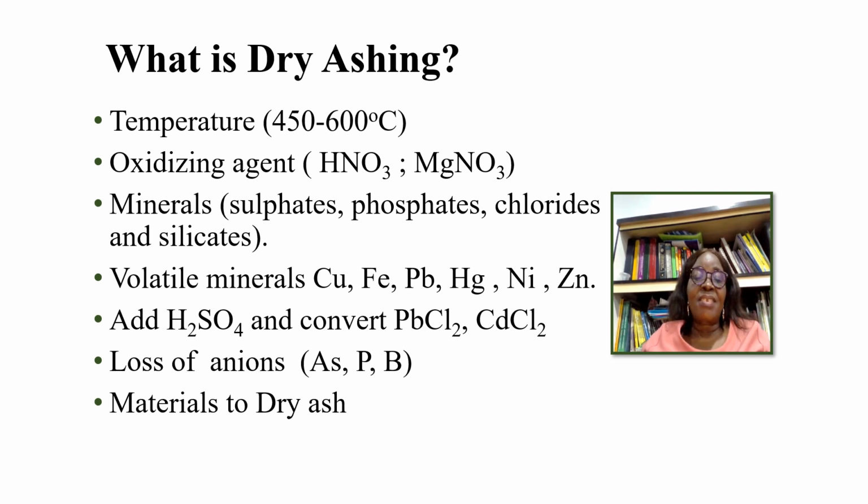Oxidizing agents such as nitric acid and magnesium nitrate can be used to fasten this process because the dry ashing process normally takes time. It can take up to 12 hours. It can take up to 14 hours. It takes time.